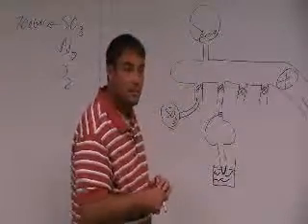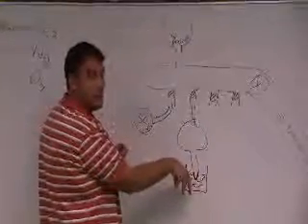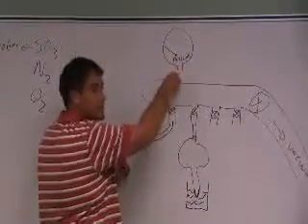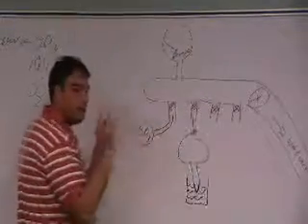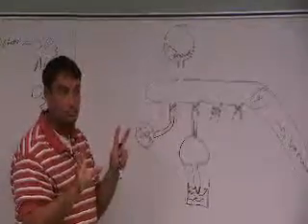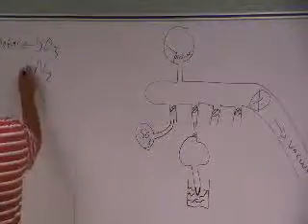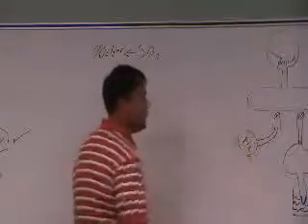And it turns out that as far as pressure goes, it will follow that cold finger. So all of that gas that's up here will actually start sucking this direction, so you can kind of make what's called a cold vacuum. All right? Are you happy? Wonderful. Then what we're going to do is we'll change out and we'll put down a nitrogen tank now.